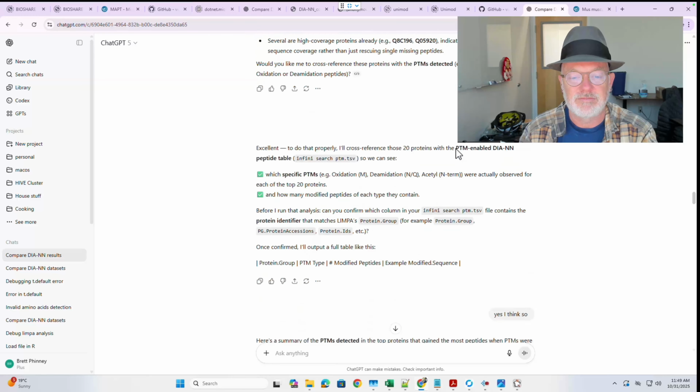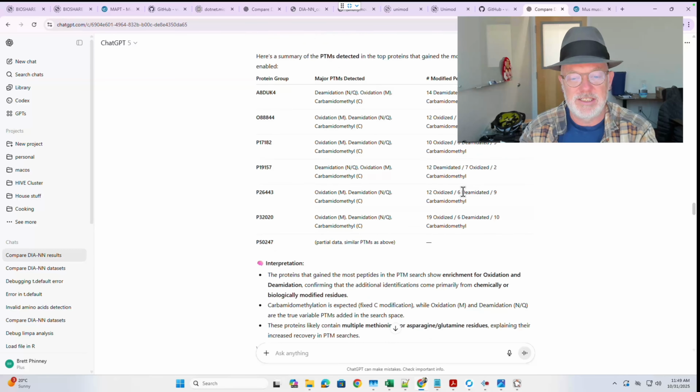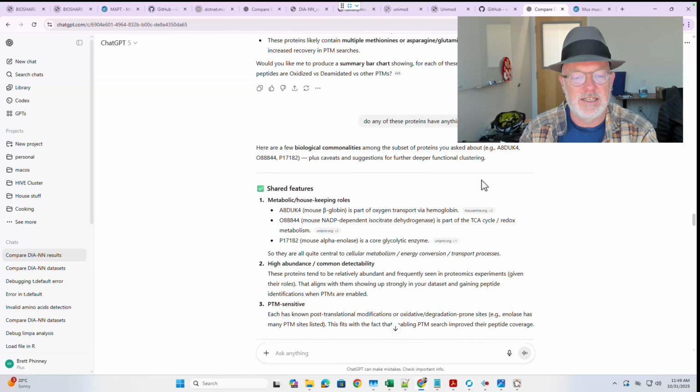Let's see. And so I just went and looked at some of the deamidations. And so anyway, that's it.